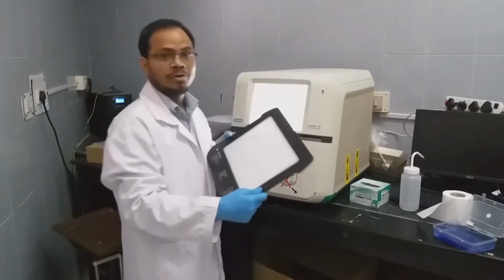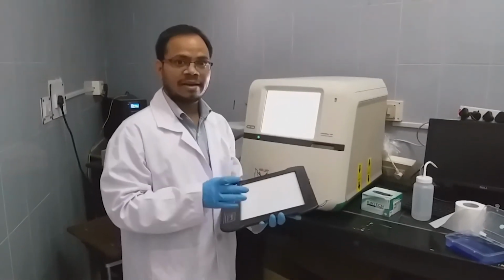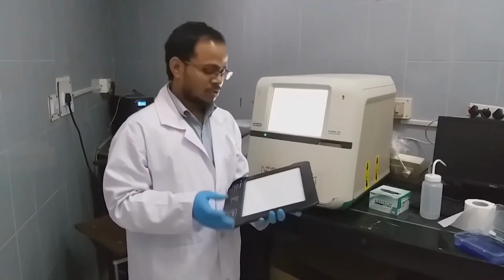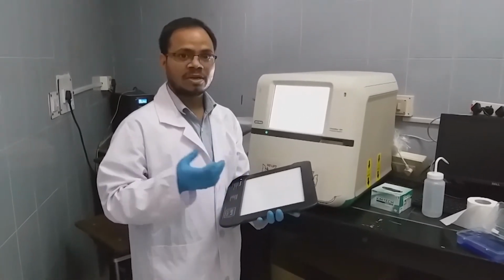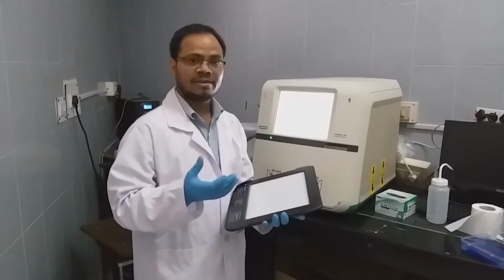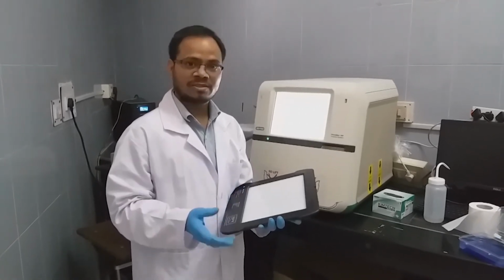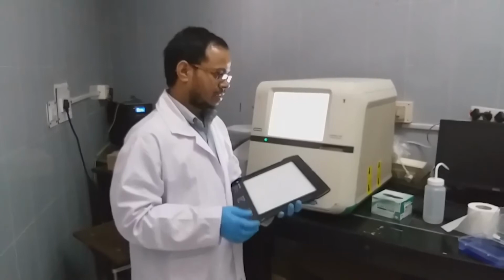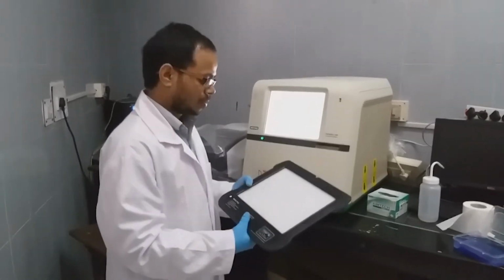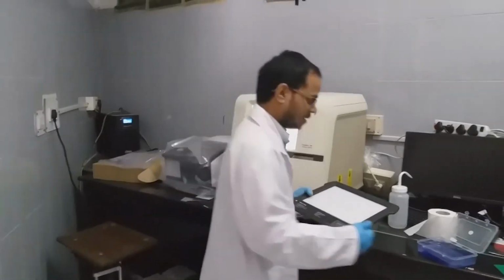Here we will use the white tray. There is another one, a gray or UV tray, also. There you can see anything fluorescent, or stained with ethidium bromide, or blots, chemiluminescent blots. But for normal protein imaging, we can use this white tray. So I am going to keep the gel on this one.